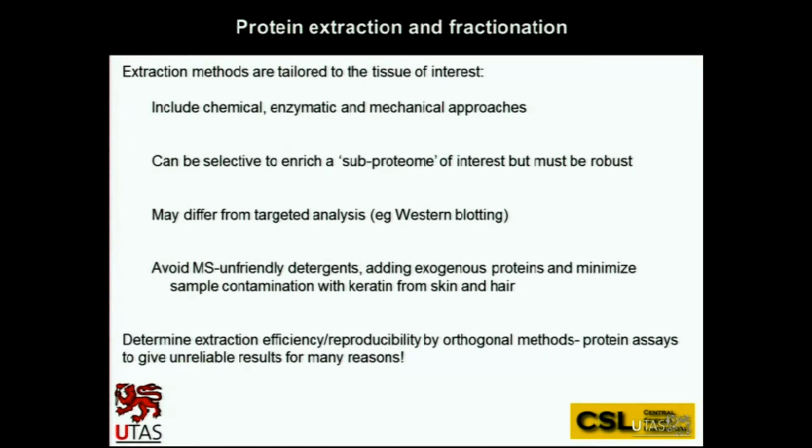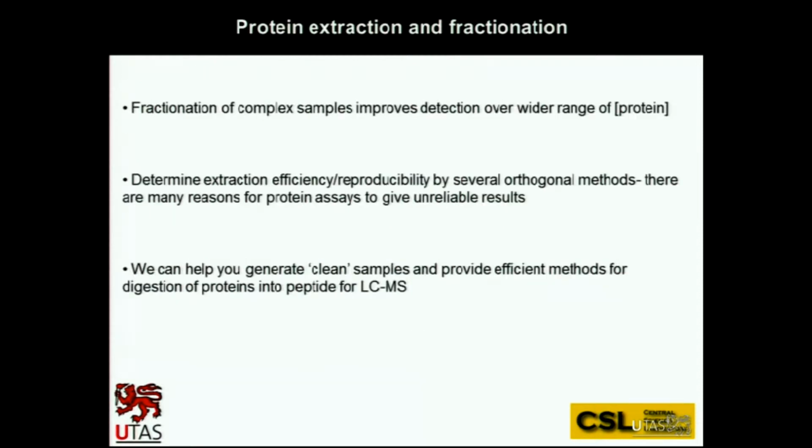And it's always very useful to determine how efficient your extraction procedure is and how reproducible it is using an orthogonal method. So protein assays, as we found out in recent years, can give quite unreliable results, and it's useful to use an alternative method.